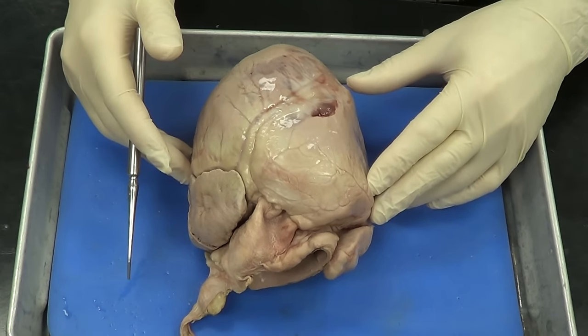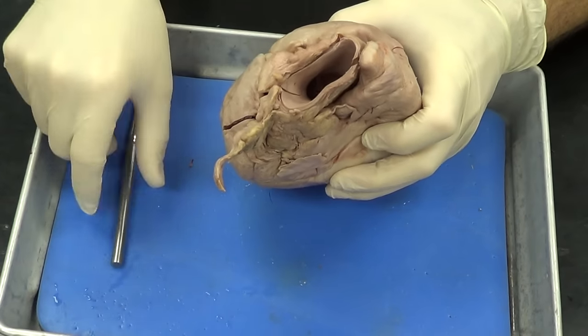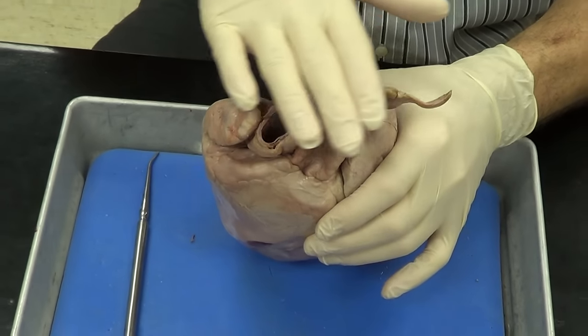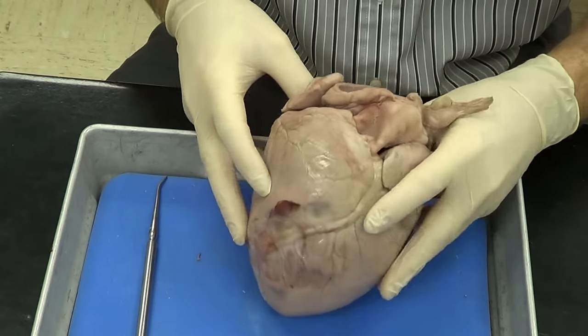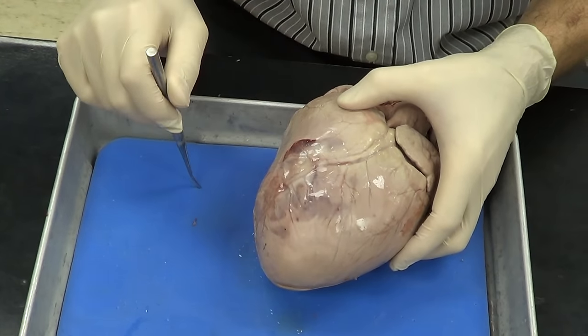Today we're going to go over the anatomy of a pig heart. The first thing we want to do is orient ourselves externally. The top part of the pig heart — the pig heart would be in you like this — is going to be referred to as the base. This is where a lot of blood vessels tend to enter and exit. The bottom part of the pig heart, where it actually comes to a point, is going to be referred to as the apex.